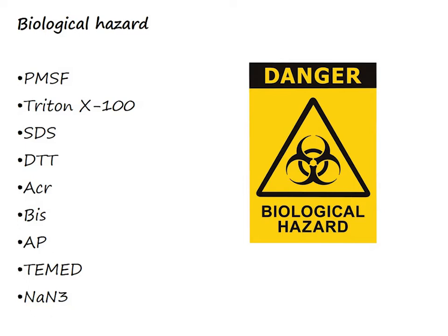Firstly, I'd like to reiterate the biological hazard about the reagents used in Western blot. We use PMSF as protease inhibitor when preparing protein samples. We use the lysis buffer Triton-X, and we use SDS, DTT to maintain the reduction state of the proteins.